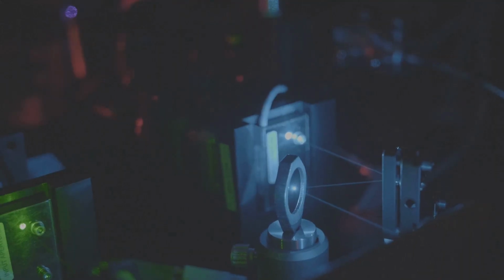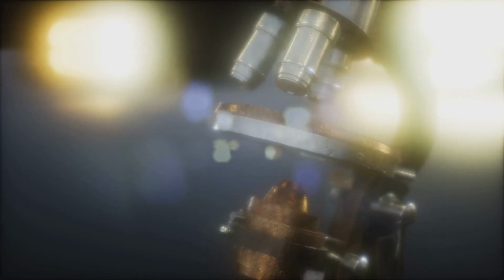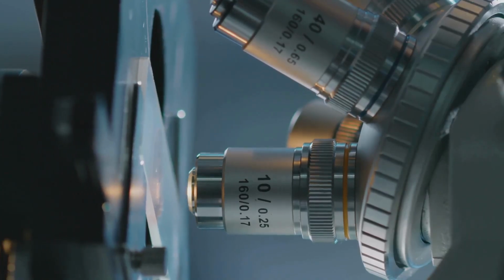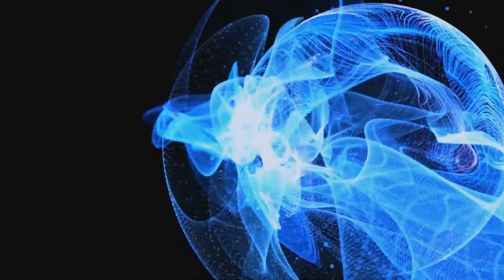These instruments make tiny things look bigger. This process is called magnification. They help us see the incredible details of cells, bacteria, the building blocks of materials. It's a universe of the very, very small. Microscopes are our ticket to explore. This exploration helps us understand life, fight diseases, build new technologies.